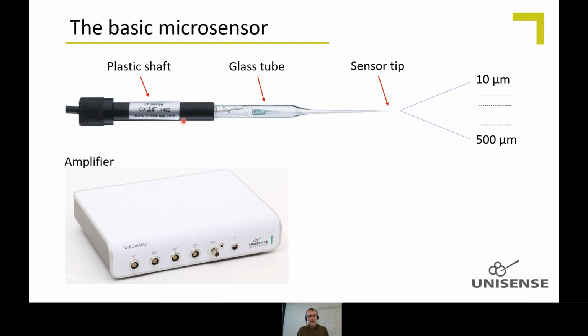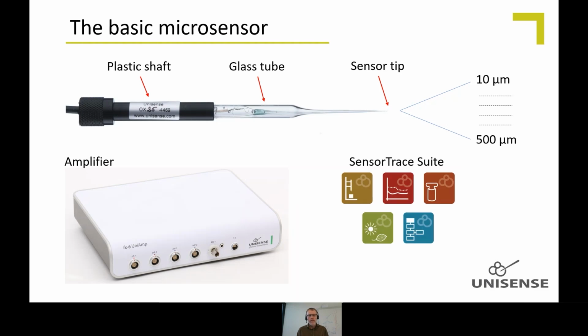Each sensor will need an amplifier. We have a number of different ones. I will get back to that. And the amplifier needs a Windows PC running our software, so we can calibrate the sensors, collect the data, see the data in real time, and so on.